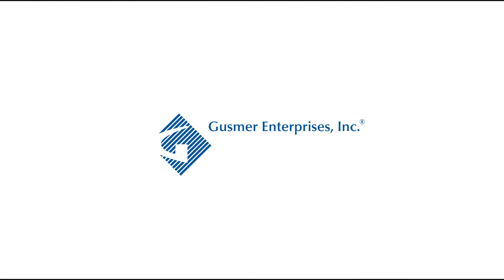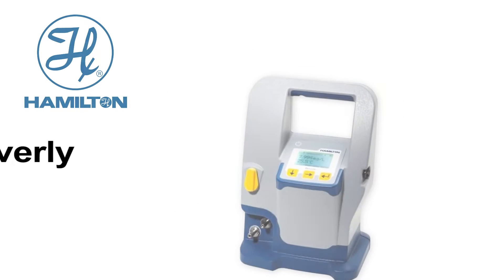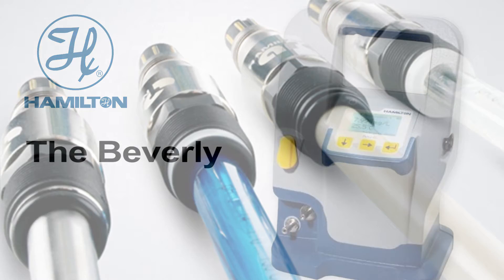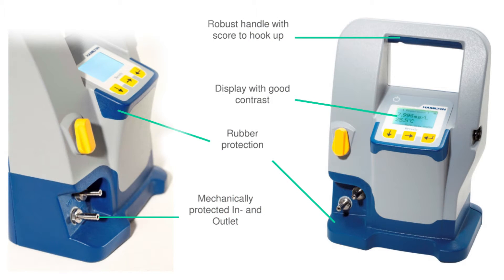Gusmer Enterprises is proud to be the North American representative for the Beverly by Hamilton, a portable dissolved oxygen meter for the brewing industry. The Beverly features Hamilton's industry-leading Visifirm optical dissolved oxygen sensor, onboard diagnostics and calibration features, and a robust design for the harshest process environments.